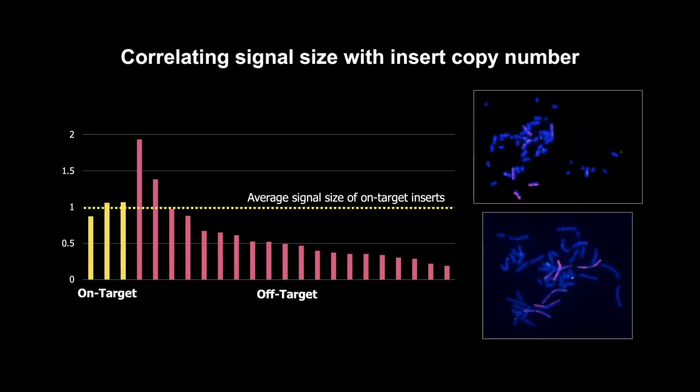Diving deeper into two individual cells from the experiment, one having a single on-target and one having two on-targets, we can compare the size of the integration events at the targets to those off-target. This analysis suggests that, assuming the off-targets are correct integrations, most off-targets are fragments, averaging approximately 1/2 the size of the on-targets, with relatively few complete or multiple integrations at off-target sites.